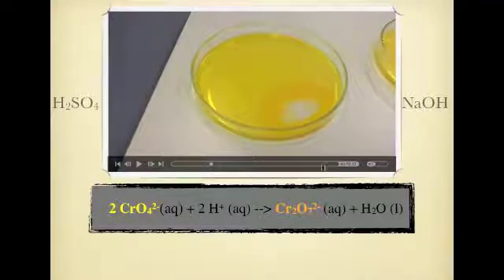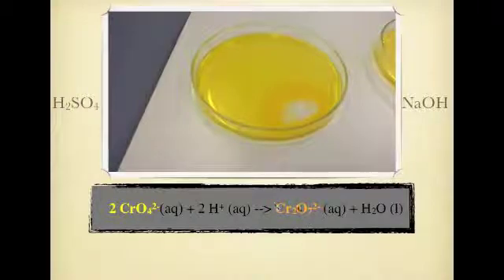Now, let's have a look what happened, and you can see just around where I've pipetted in the sulfuric acid. The edges of it are starting to turn a bit of an orangey color, and that indicates we're forming more of this dichromate. Now, why is that forming? Let's have a look. It centralizes around this one here, the hydrogen ion.